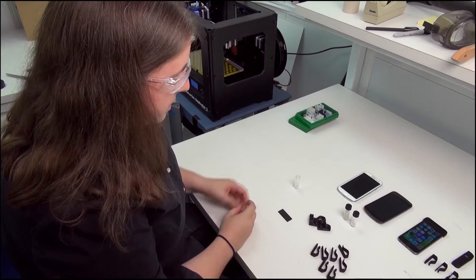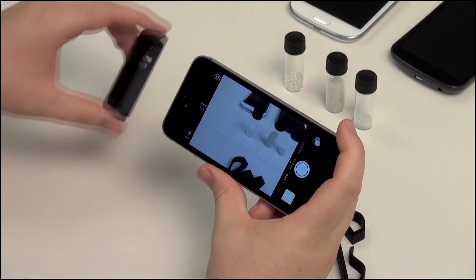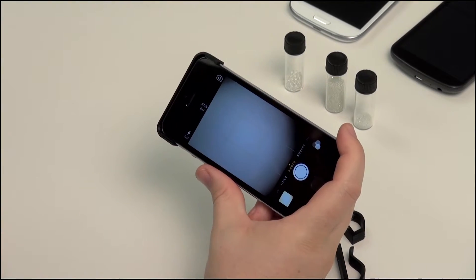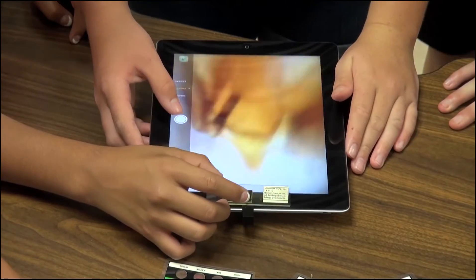Now that we've printed our plastic housing, we're going to use a little inexpensive glass bead. You can buy these online for about a penny each. When you combine a modern smartphone with a 400-year-old design for a microscope, you get a very inexpensive, small device capable of detecting anthrax or simply looking closer at a bug or a leaf.